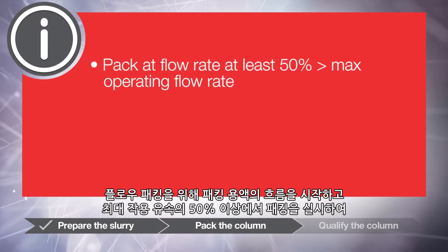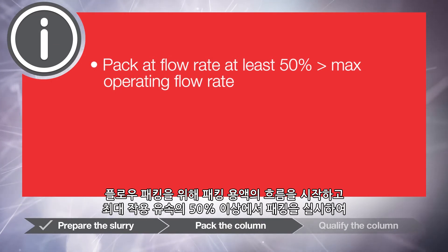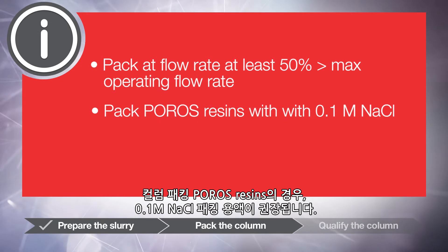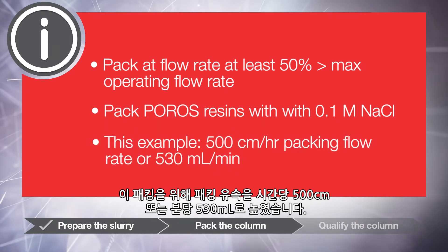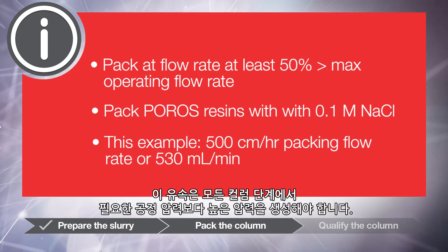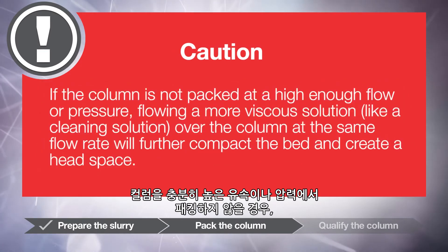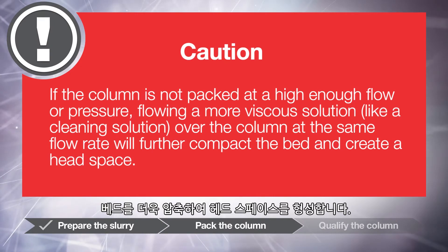For flow packing, initiate flow of your packing solution and pack at a flow rate at least 50% greater than the maximum operating flow rate for your chromatography operation. For column packing Poros resins, we recommend a 0.1 molar sodium chloride packing solution. For this pack, we have increased the packing flow rate to 500 cm per hour or 530 mL per minute. This flow should yield a pressure higher than the desired operating pressure for all column steps. Caution: if the column is not packed at a high enough flow or pressure, flowing a more viscous solution such as a cleaning solution over the column at the same flow rate will further compact the bed and create a head space.